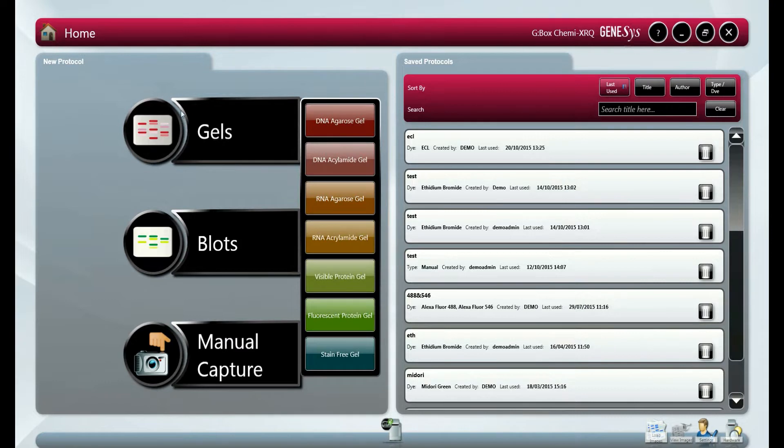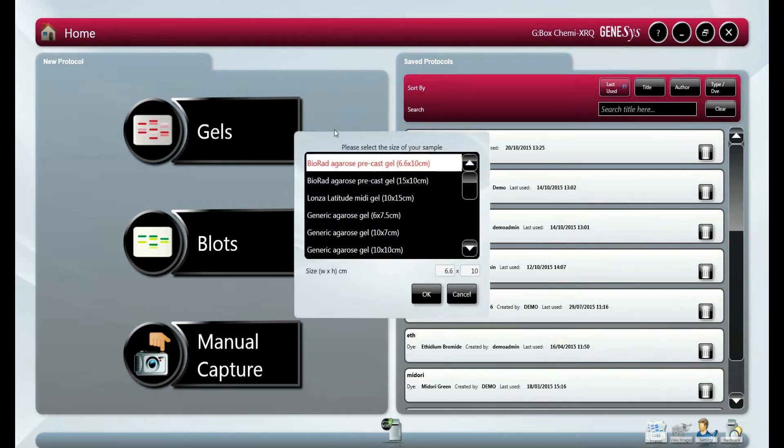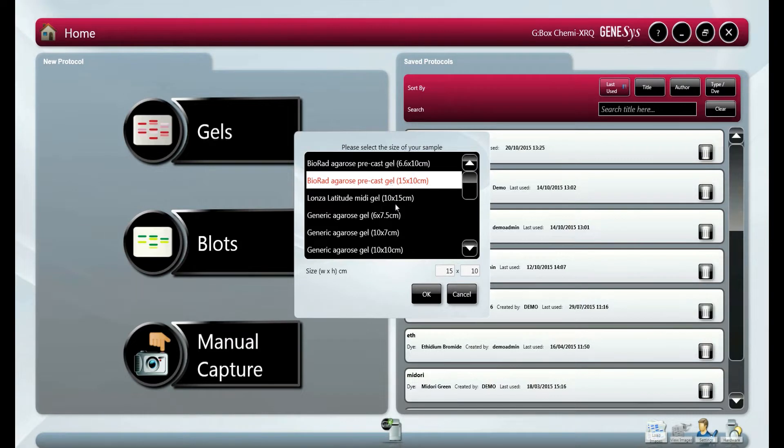We select gel and DNA agarose in this example. Next we are asked to select the gel size. This is for automatic zoom for better image resolution.